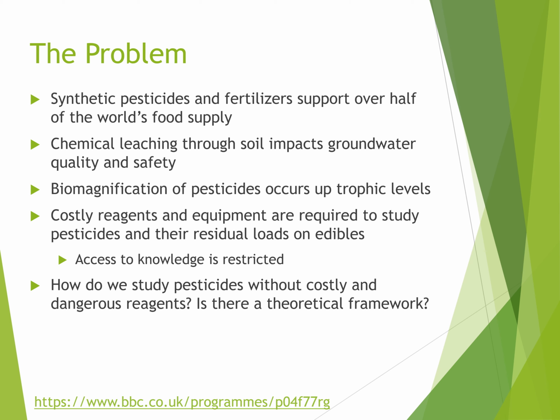Studying pesticides requires costly reagents and equipment. Access to knowledge is thus restricted from this cost. So we wonder, how do we study pesticides without costly and dangerous reagents? Is there a theoretical framework to fall back upon to investigate pesticide properties?